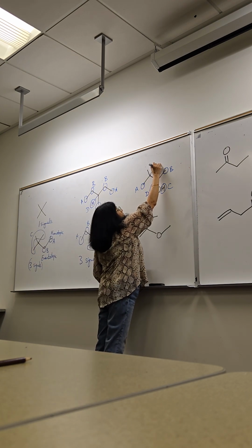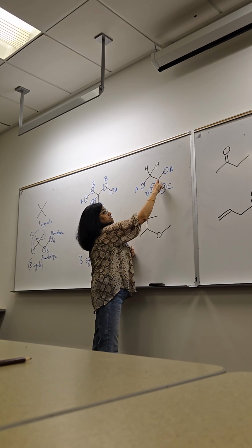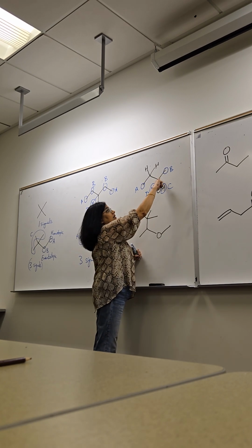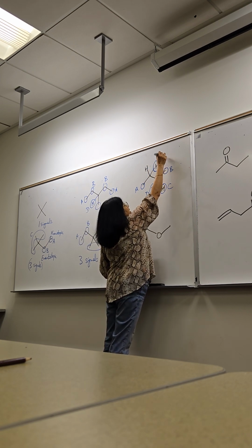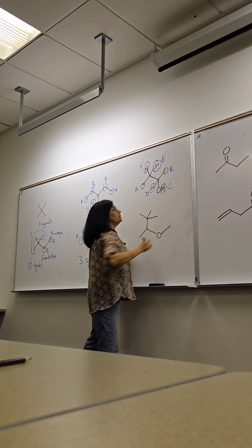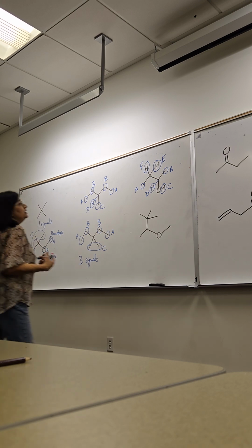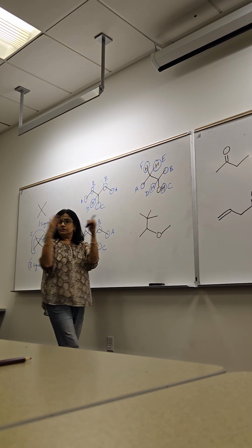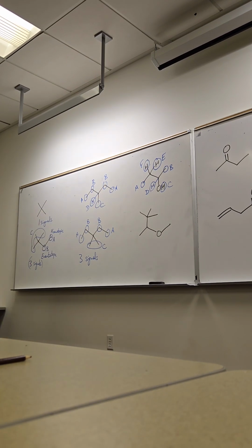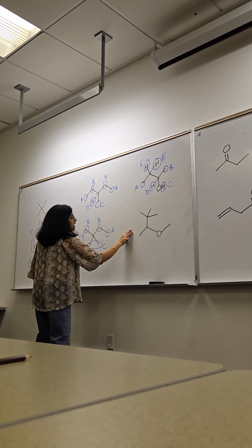What kind of hydrogens are those? There's a stereo center, so our expectation, and I keep saying expected because sometimes the instrument result may not match, is that they are diastereotopic, so they should give us separate signals. Diastereotopic, separate signals. Homotopic and enantiotopic, same signal. Okay, what about this one? How many do we expect?